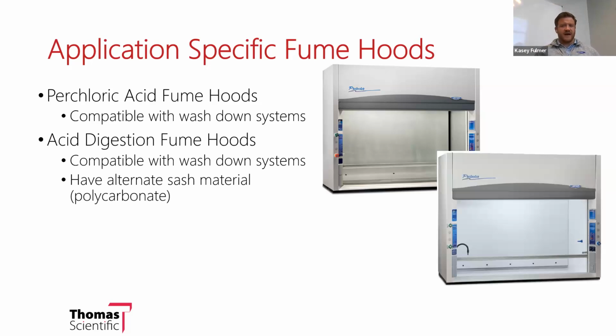There are other acids that operate similarly to perchloric acid, but are not as volatile, and they require different materials to create their explosive salt, I guess. And in those situations, you'd go with an acid digestion hood.